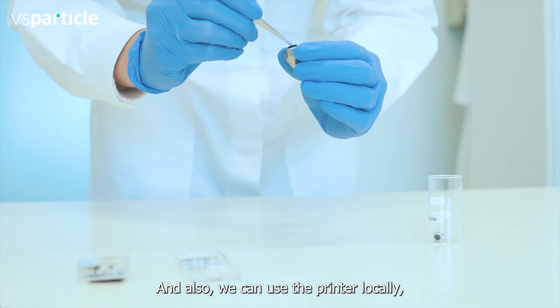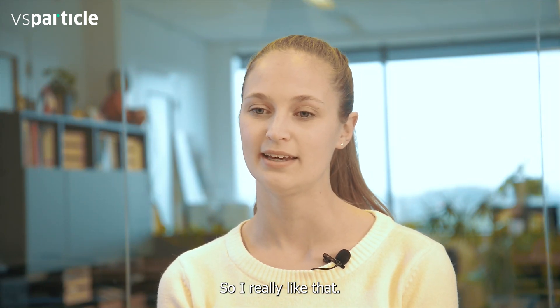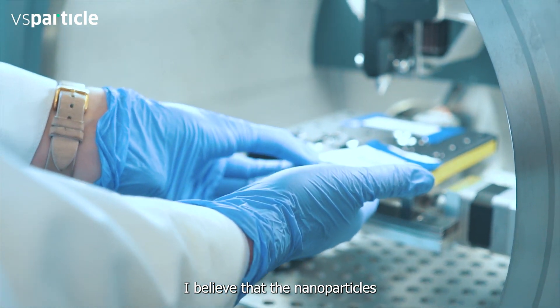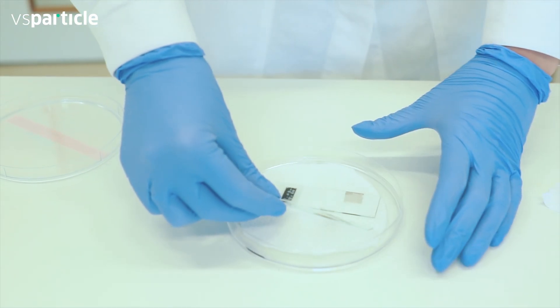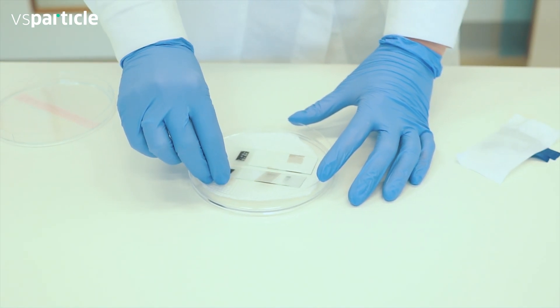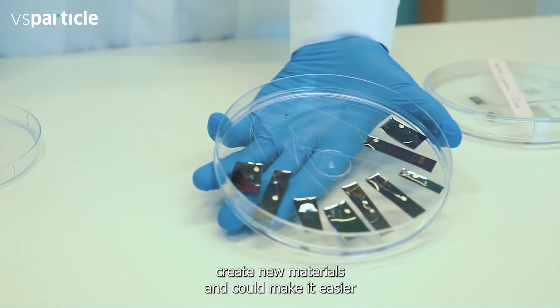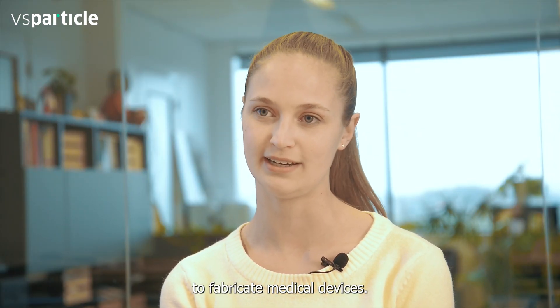We can use the printer locally which means no further processing steps are required, so I really like that. I believe that nanoparticles and nanotechnology is the future of medicine and medical technology, and the VS particles nanoprinter has made it very easy to create new materials and could make it easier to fabricate medical devices.